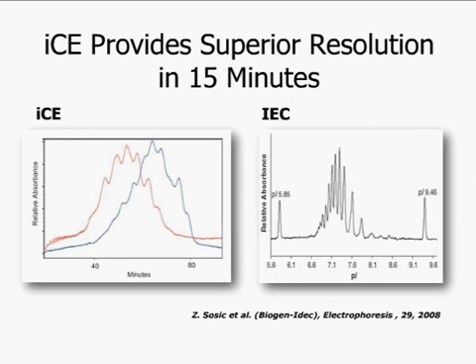Beyond longer separation times, high surface area to volume ratios can lead to mixed mode separations that significantly limit the separation capacity of an ion exchange method, typically for a larger compound. This not only limits the resolution, but also in many cases requires molecule-specific methods to generate useful charge heterogeneity data.